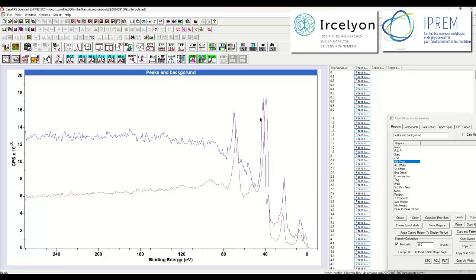So these are vanadium photoemission peaks, and they are being influenced by a carbon overlayer. So the inelastic scattering here is characteristic of vanadium scattered by carbon, and the shape we see here is more characteristic of vanadium oxide being scattered by vanadium oxide.